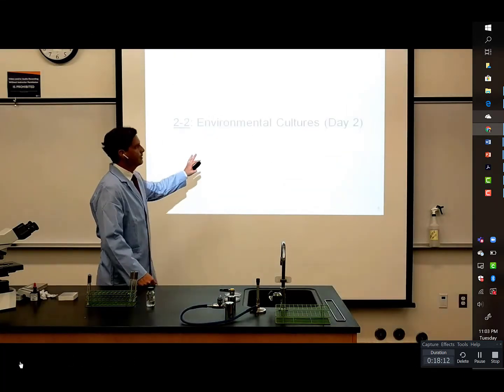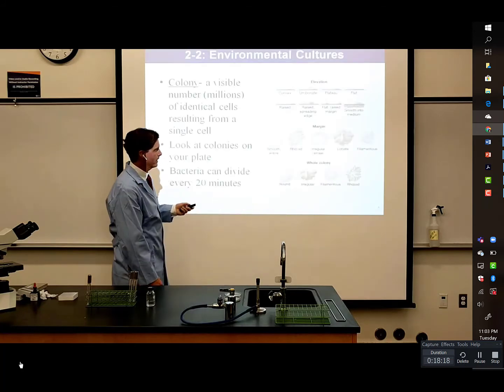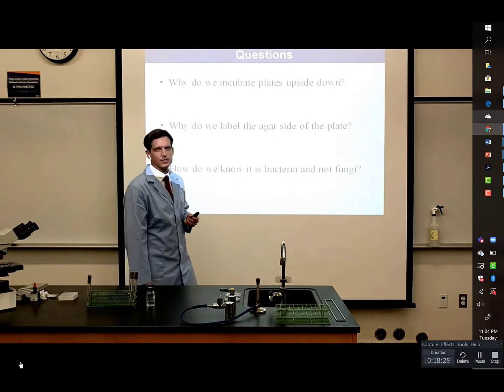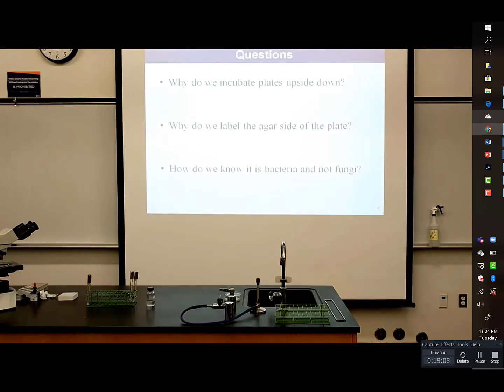So environmental cultures, day 2. When I come back and we look at this, we'll be trying to observe what the colony types are like. So I'll skip over this for now, and we'll come back. We probably should take time, though, to answer these key questions here. So why do we incubate plates upside down?